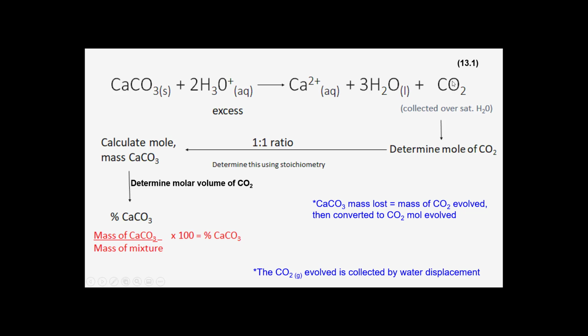Once we determine the amount of CO2 that has been collected, and you do that by first determining your sample by weighing your weighing boat and sample and so forth on this one. But this one is the generator. You weigh the generator before the reaction and after the reaction. The before will be more than the after because of the loss of CO2, that is the mass of CO2 that you're collecting. So you will collect that and then you will determine your moles of CO2.